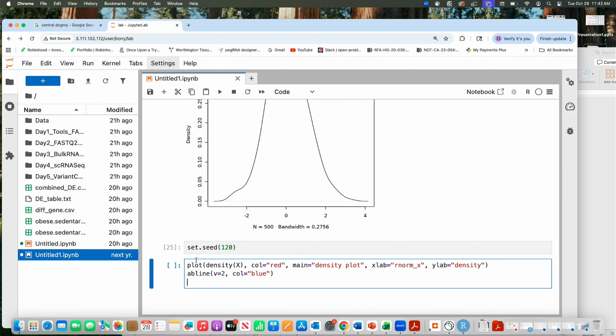What I guess is a bit weird is that in R, you use two different commands to work on the same plot. Some languages usually do that as part of a parameter or by modifying the first line. In this case, R knows you plotted something before, and you added something to the plot that you did before. That's what is a bit weird. Okay, so everybody fine? This is the same thing as what we did with our plot.